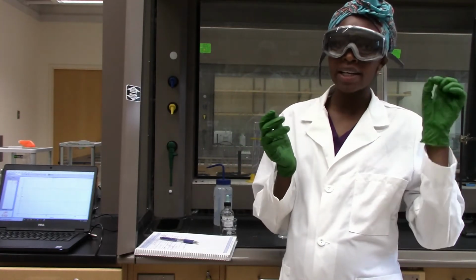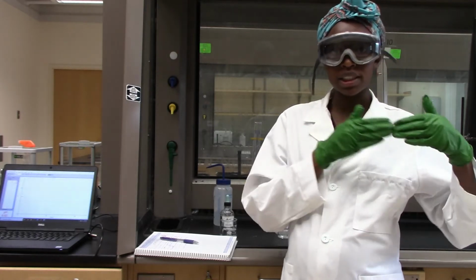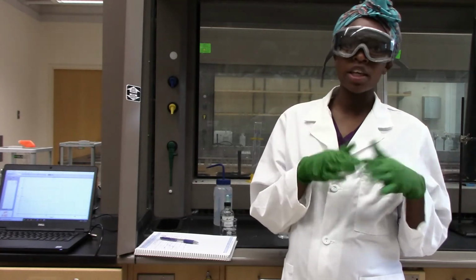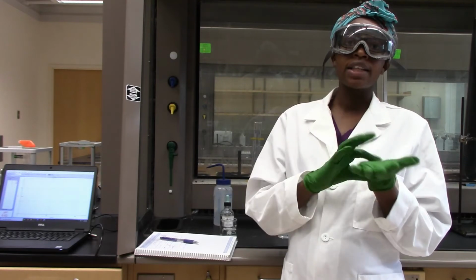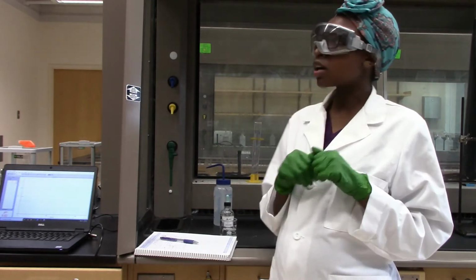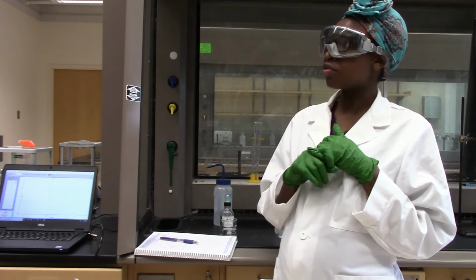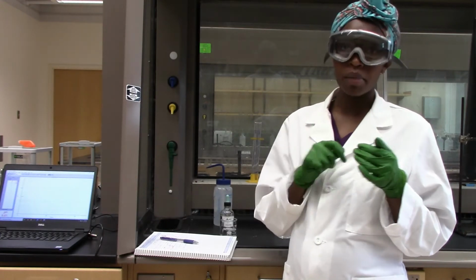So if you add an acid to a buffer solution, then you don't expect a drastic decrease in the pH readings. And the same thing, if you add a basic solution to a buffer, it doesn't usually raise the pH by a drastic amount. So today we are going to measure the effects of pH change in pure water and also in a buffer solution.